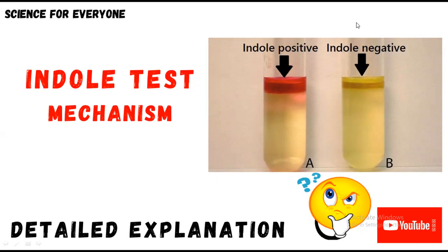So in today's video, I will discuss what basically the indole test is, what the principle is, and how it is performed in the laboratory. At the last I will show you the chemical reactions, which is the most important part of this video: what happens inside the indole test, and what chemical reactions are involved. And at the last I will give you examples of different bacteria that give positive and negative indole results. Okay, so let's start with the video lecture.